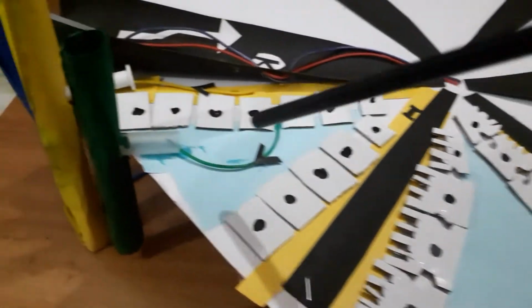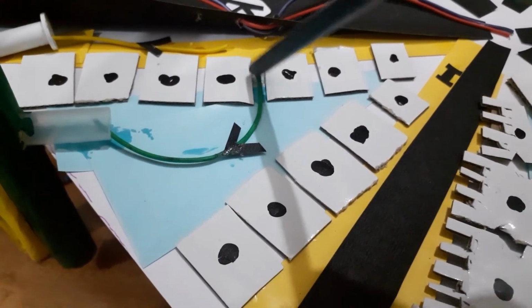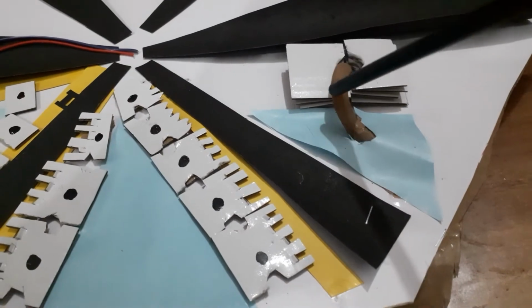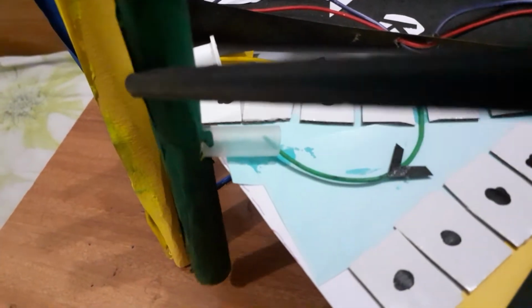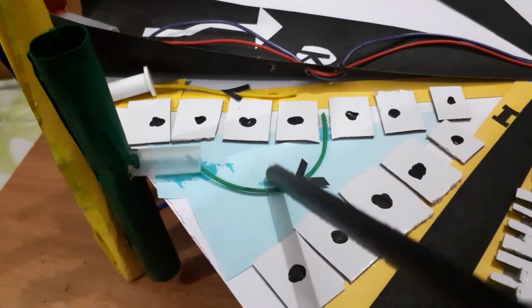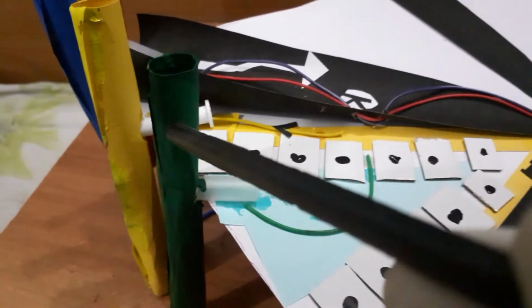This is the cholangioles, and through the cholangioles, this here is the biliary canaliculi, and this is the duct of Hering, and this is the cholangiole, and now coming into the bile ductule. This bile is going outside from the center to the periphery, so it also has a centrifugal arrangement. The flow is centrifugal.